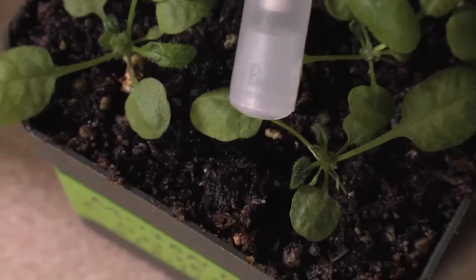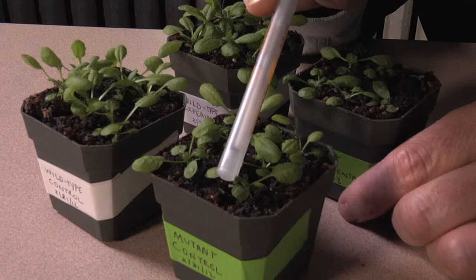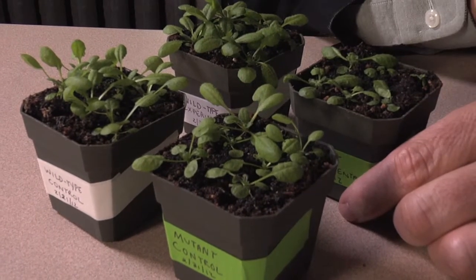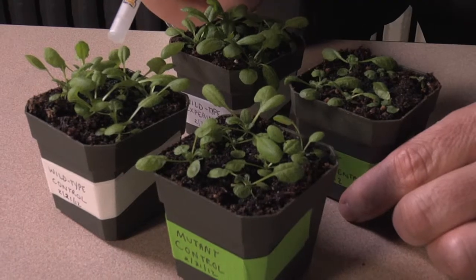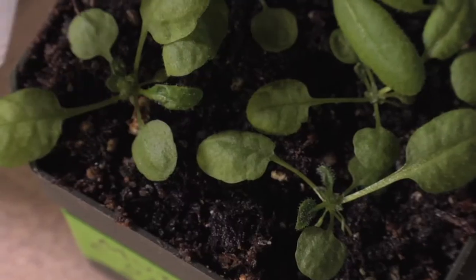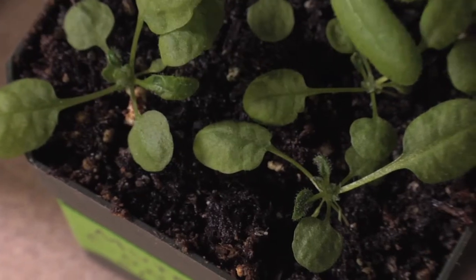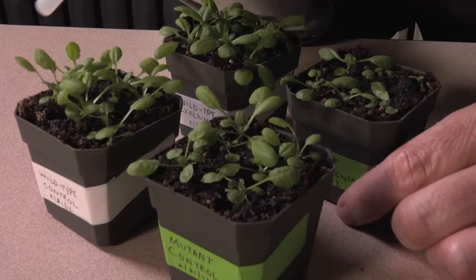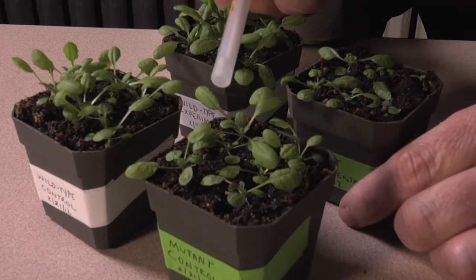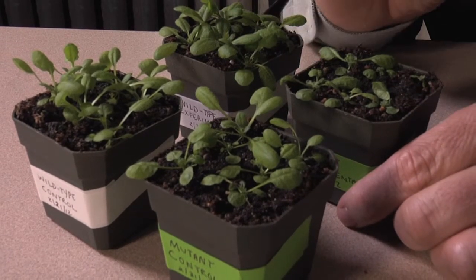I can also see that there's some curling up of the new leaves that are emerging from the center of the rosette. That isn't happening over here in the wild type plant. And the texture of the leaf is a little bit wavy over here as well. That isn't happening on the wild type plant. So these are effects that are specific to this gene being disabled.